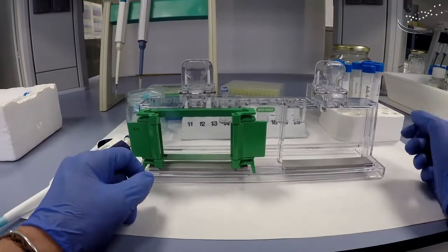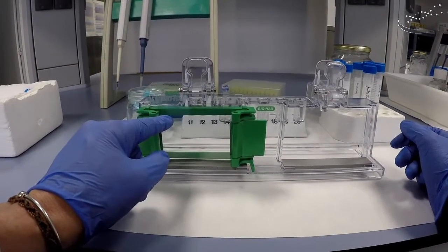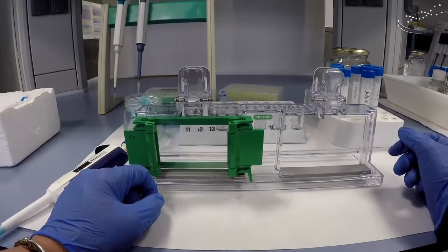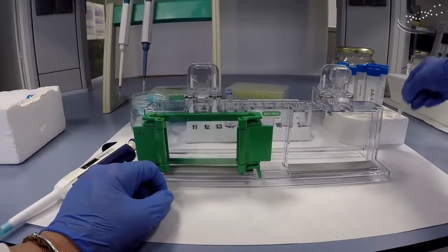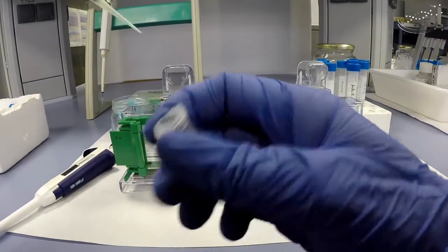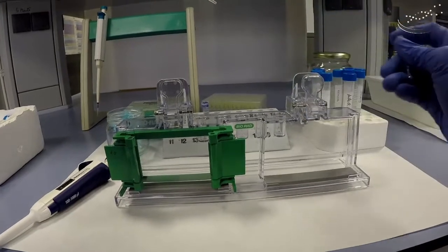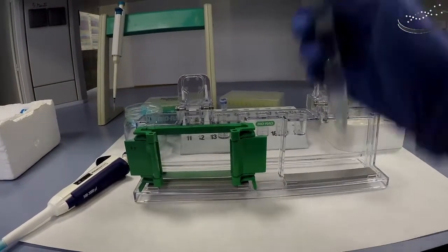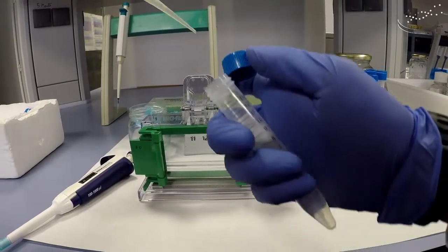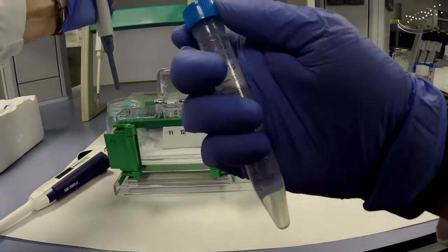What we have to do is add the components, mix, and then add the solution between the two glass plates, up to the point shown, which is about 7.5 milliliters. Here's the APS — we're going to add 60 microliters to the solution. It's important to pipette inside the solution, so insert your pipette tip below the level of the liquid to make sure it gets in.